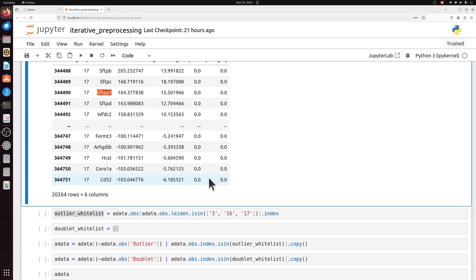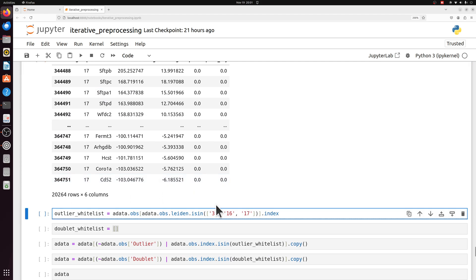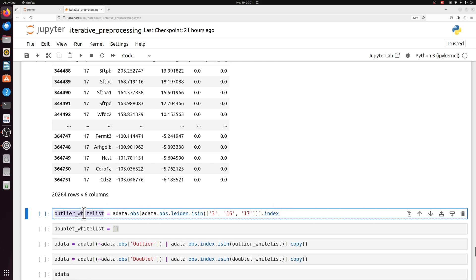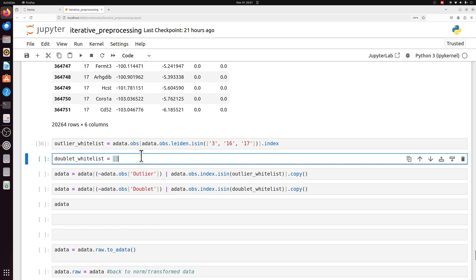So how do we keep these and get rid of the actual outliers? Let's just assume we looked at all the cells, we annotated all the cells, and we only determined that these three are actual cell populations, the others were actually outliers. Well, we can get a list of barcodes. In this case, I'm just making a whitelist of all the barcodes that we want to keep. So is it in cluster 3, 16, 17? And we're just looking at the observation data frame and getting the index, which just corresponds to the barcode.